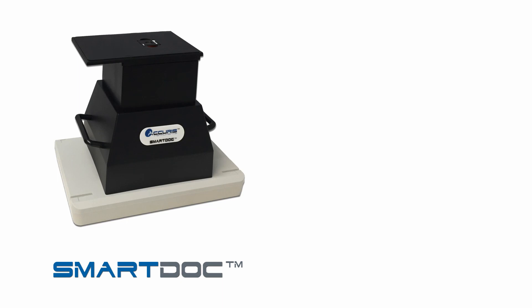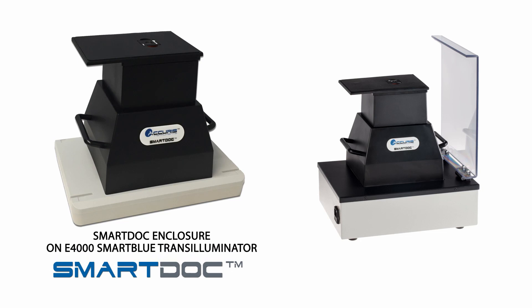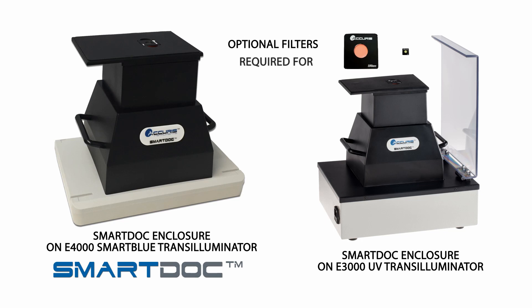Note that the SmartDoc imaging enclosure can also be placed onto a standard blue light transilluminator, such as the Accuris Smart Blue. And if you stain your gels with ethidium bromide, it can be used with a UV transilluminator, such as the Accuris E3000. Additional filters are available for UV imaging.